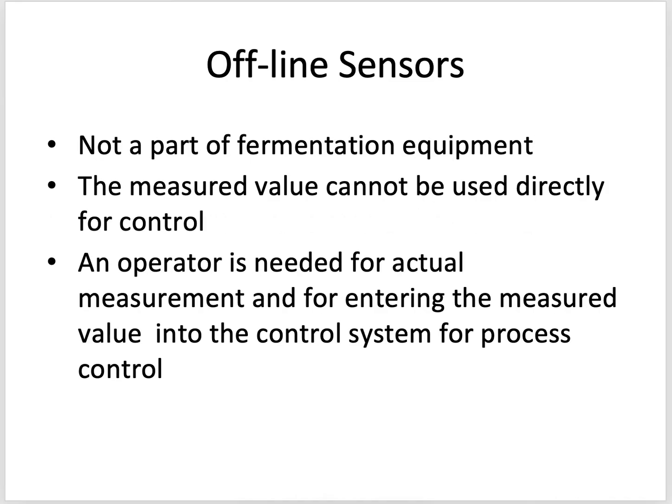In the case of offline sensors, they are not an integral part of fermentation equipment, and the measured value cannot be used directly for control. And again, an operator is needed for the actual measurement and for entering the measured value into the control system for process control.